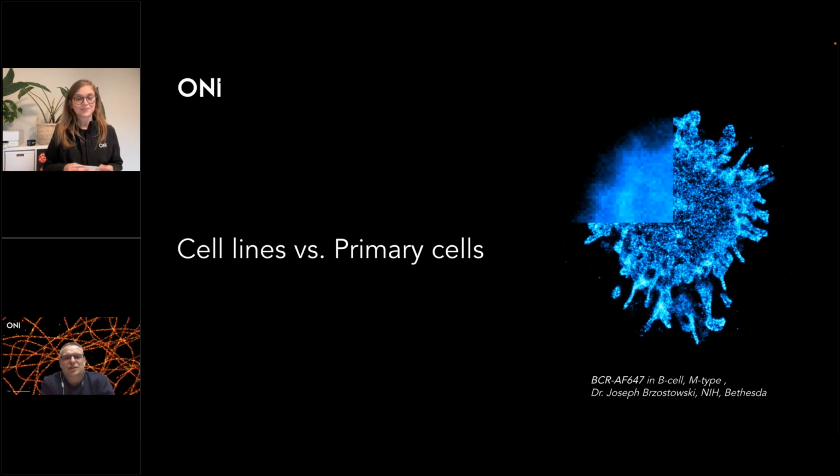If you are already using some conventional microscopy techniques, you are really free to use this. However, you need to take into account some very important things. The most important thing is that dSTORM or single molecule localization microscopy is imaged in TIRF mode, which is total internal reflection microscopy. In other words, it's very close to the coverslip. So one of the main requirements for this technology is that you are using cells which are adherent to the surface, which sometimes might be very tricky when you're using primary cells, especially in immunology, as those cells are not adherent cells, but cells in suspension.